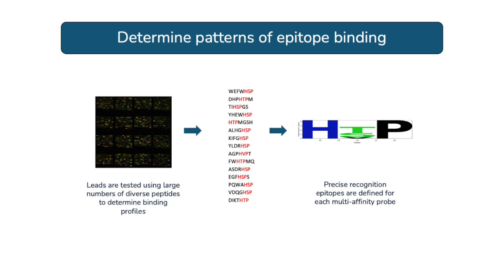millions of different peptides that cover the human proteome to learn more about a specific pattern of epitopes that a probe might bind. This accounts for the fact that you might raise a probe to, for instance, the motif tryptophan, asparagine, lysine, and it might bind to epitopes that are not just tryptophan, asparagine, lysine, but are, for instance, tyrosine, asparagine, lysine, with some level of binding strength.